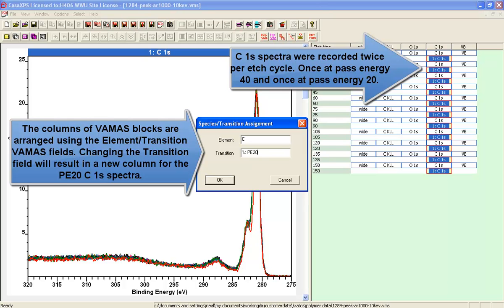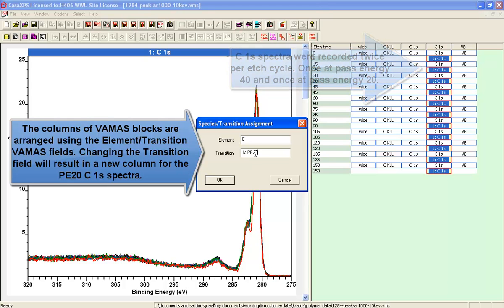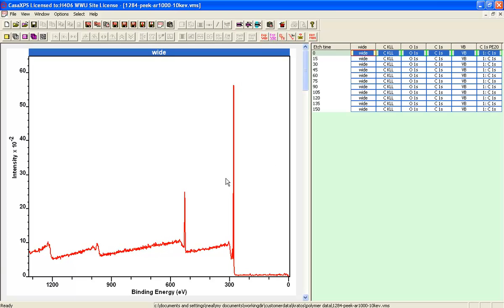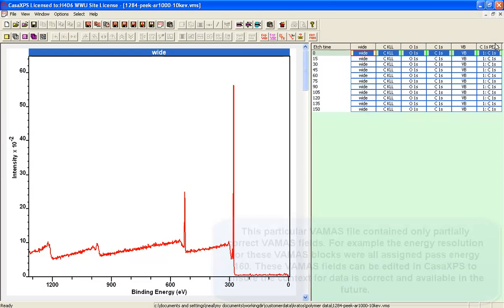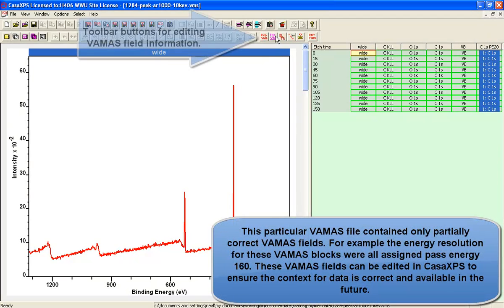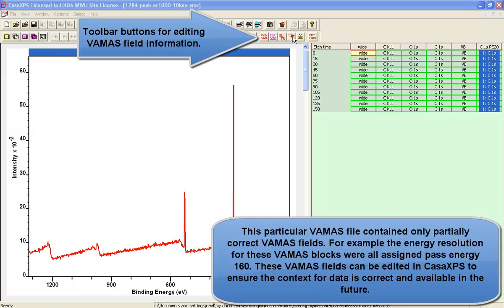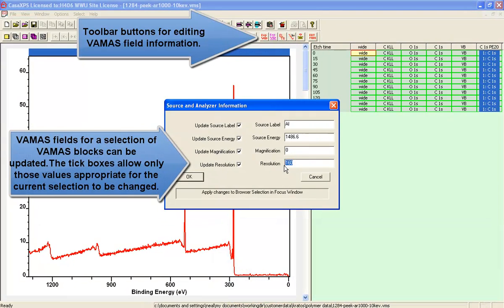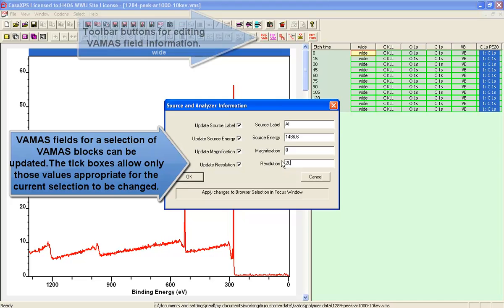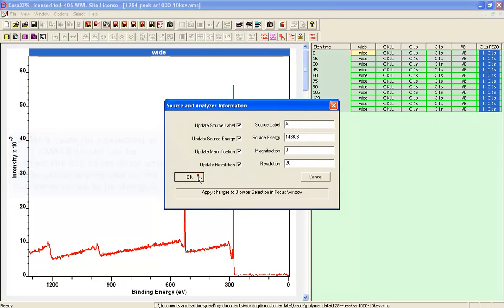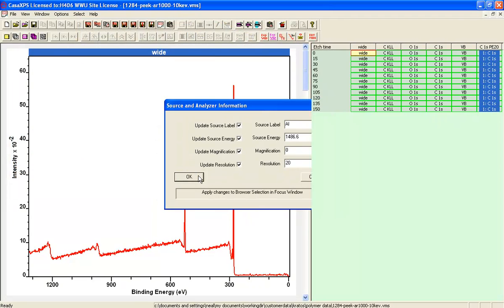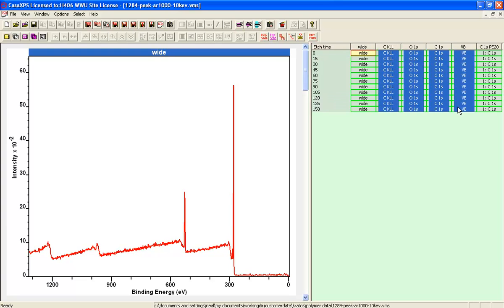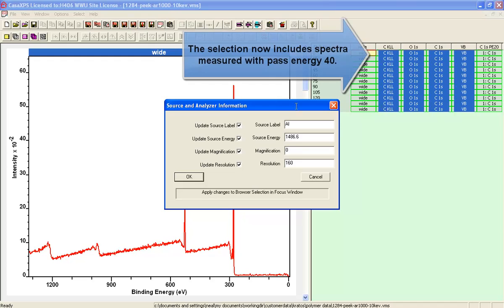We'll do a bit of bookkeeping initially. We need to have all these measurements that have been saved as VAMAS blocks on the same row for each etch cycle. The first job was to set the element transition field for the pass energy 20 spectrum that was a repeat of the carbon 1s, and we entered a different element transition field so that it would align as a new column on the right hand side.